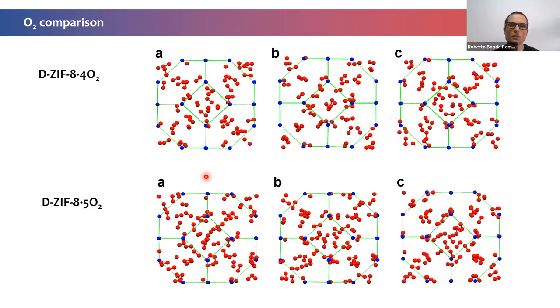when we look at the different orientations of the crystallographic view. There is a more random orientation, even though they are located in different layers. There is not a strong absorption in particular symmetric constrained places, which is one of the things that has been shown by X-ray diffraction. So we found that this technique, total neutron scattering, is more suitable for studying gas absorption in porous materials.